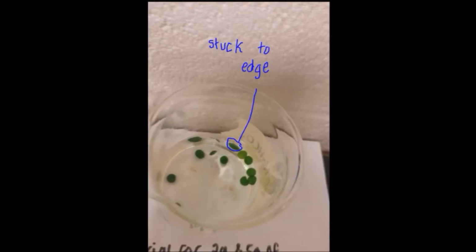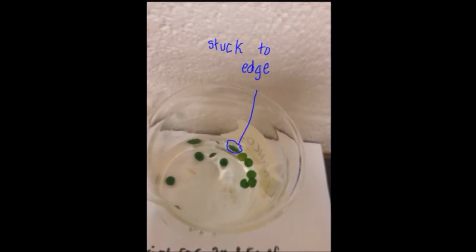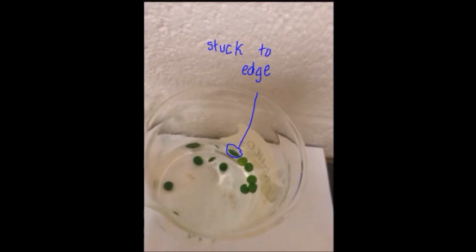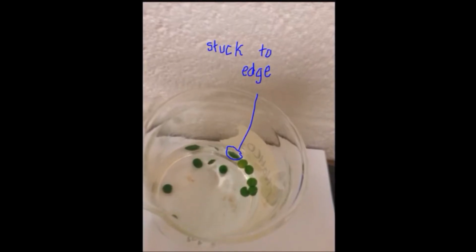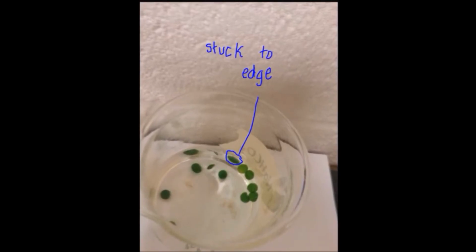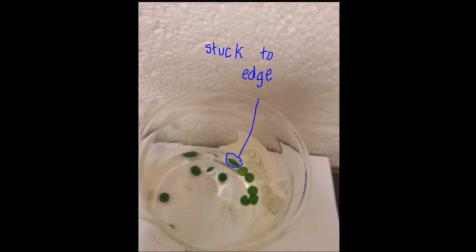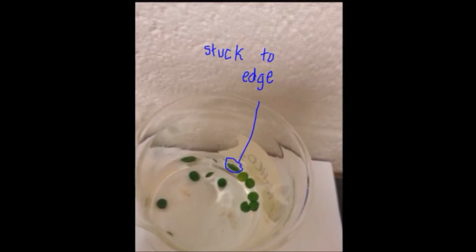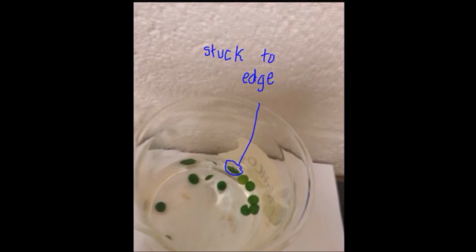Experimental error is the leaves were being stuck at the grooves in the sides of the beaker, which prevented the leaves from floating up to the surface. This led to a discrepancy in results because not all the leaves were rising, and it indicated that the rate of photosynthesis was slower than it really was. A way to improve the experiment is to tap the areas where the leaves may be stuck, which will encourage the leaves to rise in the presence of oxygen.